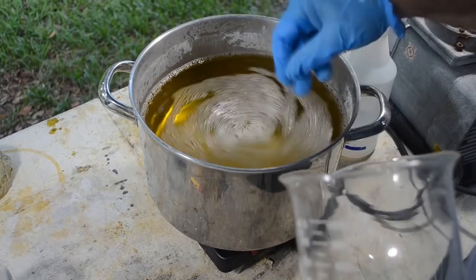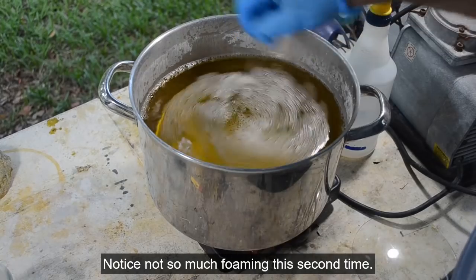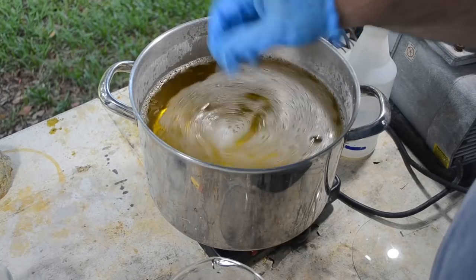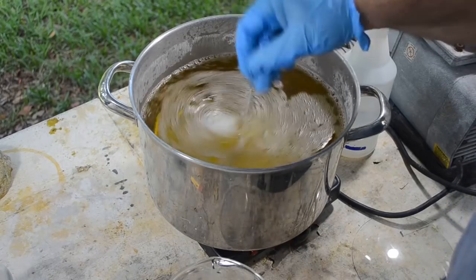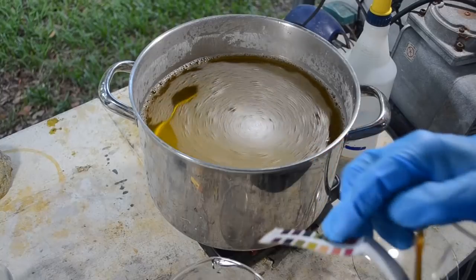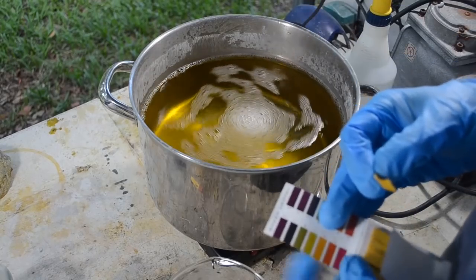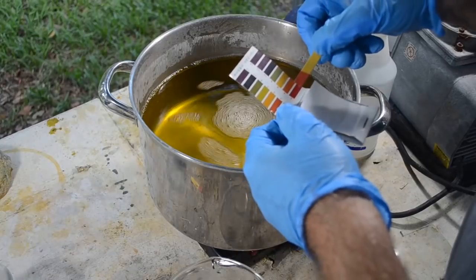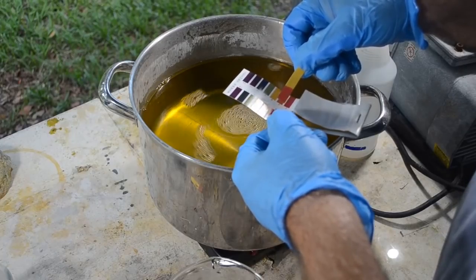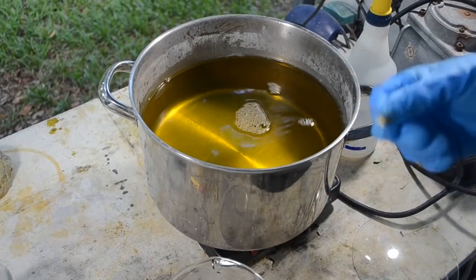Okay, let me stir this up pretty good and we'll measure it and see what we've got. So we were starting out at 5 3/4 to 6, I would guess. Let's see where we are now. Not near as much foaming as before, and none of that nasty white precipitate is forming. So it's behaving as I expected. That's good. Sometimes when I start filming, all kinds of strange stuff happens. Oh, that's pretty good. I would say that's 3 or maybe a little bit closer to 2. 2.5 maybe? Somewhere between 2.5 and 3 possibly. So I would say we're there. That didn't take much acid at all.